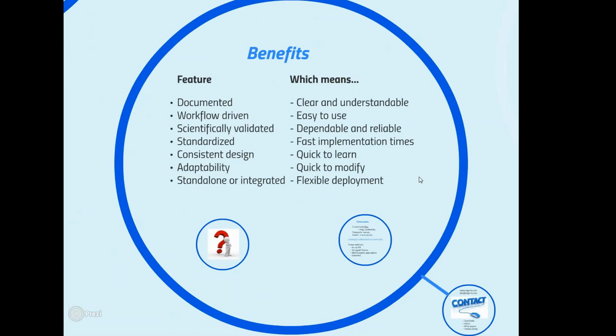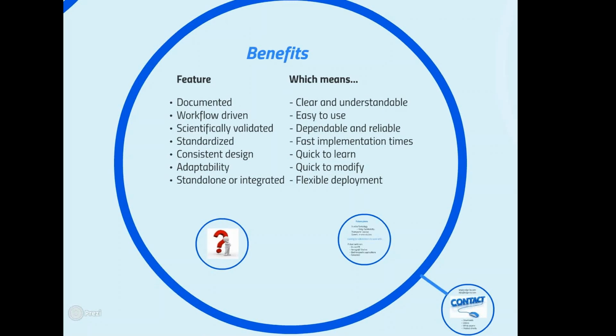They're also adaptable, so you can adapt them to the details of your data analysis, and also you might adapt them to different file formats and plate layouts, etc. during their operation. You can operate them in standalone mode, as we just showed you, or they can be fully integrated with the BioRails platform or the BioVia ELN.